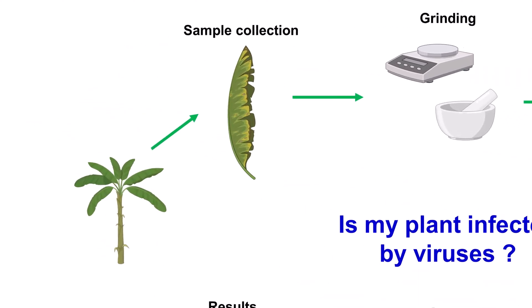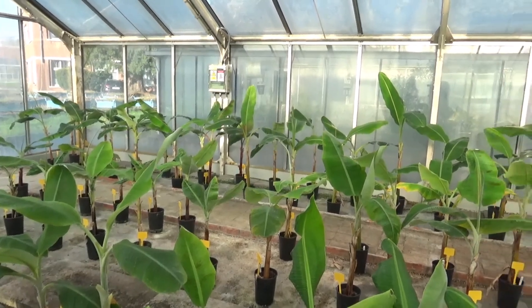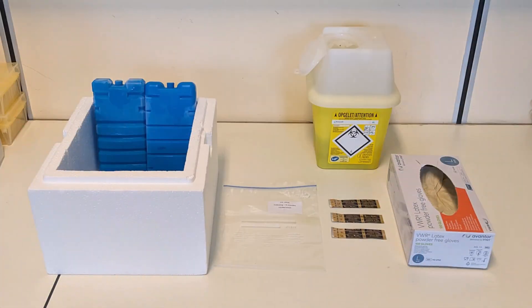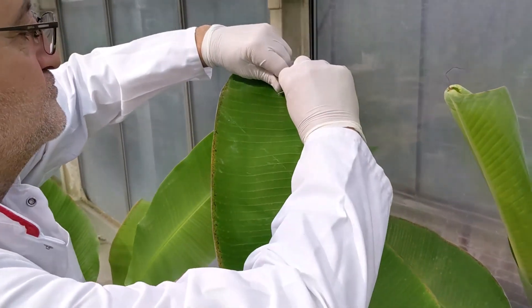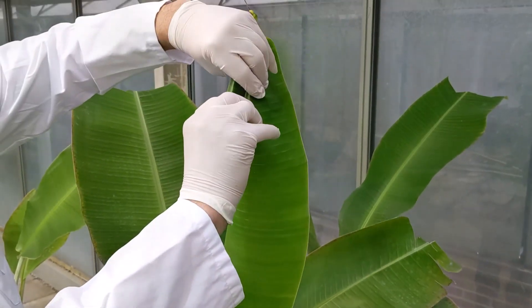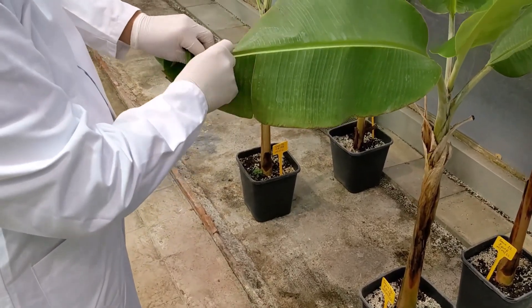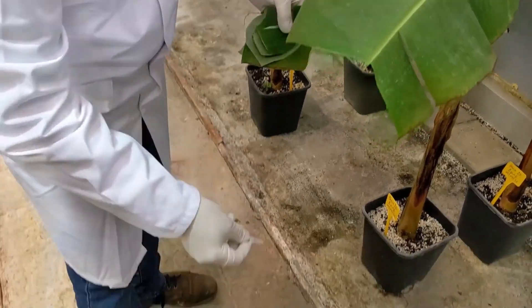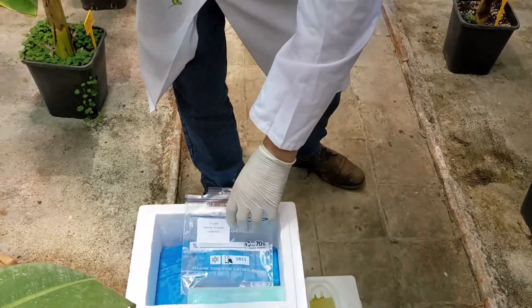The first stage is the collection of leaf samples from banana plants growing in the greenhouse. All collection material has been previously prepared and disinfected, and collection bags have been labeled with a unique identifier for each sample. The tip of the banana leaf is collected with a sterile scalpel, placed in the collection bag, and the bag is closed. To maximize reliability, four individual plants per accession are tested, and the three youngest leaves are collected from each plant. Any suspect symptom is also noted.